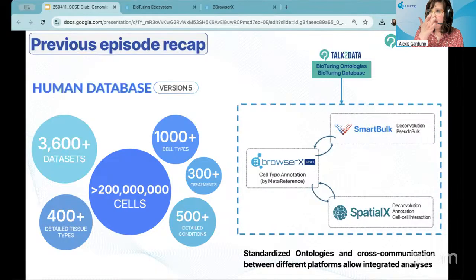We also covered how our team processes these publicly available data sets from different systems, how they're curated, and how we build our own standardized ontology systems to really cross-communicate across different platforms. So for example, utilizing the version 5 human database to apply cell type meta-reference annotations on your own internal data. From there, we also have deconvolution of pseudobulk within the SmartBulk app, so being able to apply these annotations, using all of the single cell RNA-seq data, to bulk RNA-seq analysis. And this pipeline also integrates within the spatial X or spatial transcriptomics space.